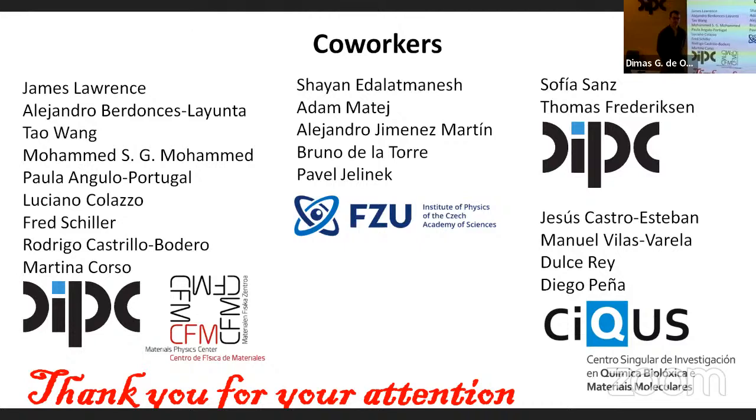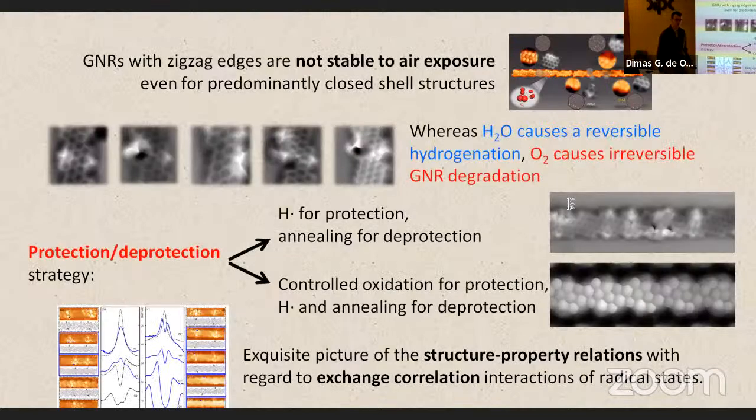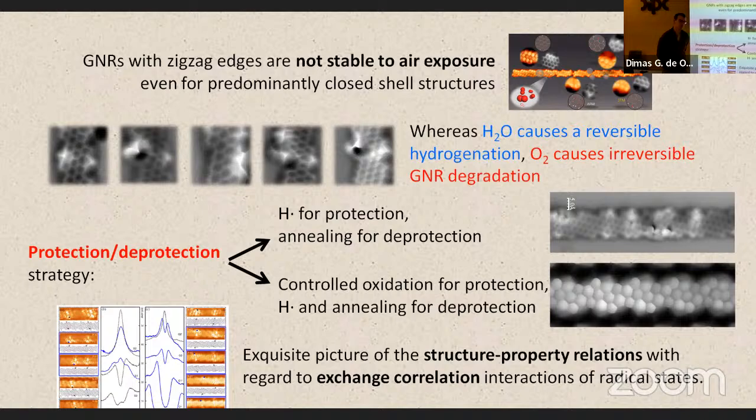I have a question about the Kondo measurement. The zero bias anomaly, do you see it as a conductance in one ribbon or on the gold surface at all? We see it at the position of the defect. So we see it on the ribbon. We don't see it if we go far away from there on the gold.